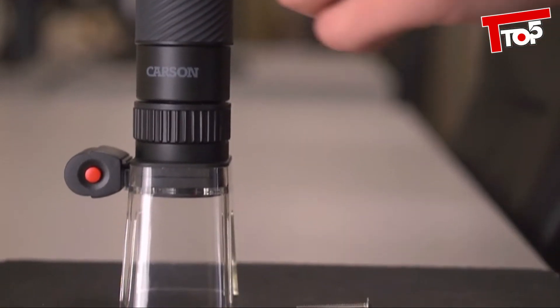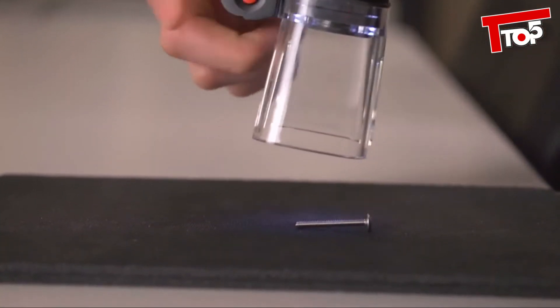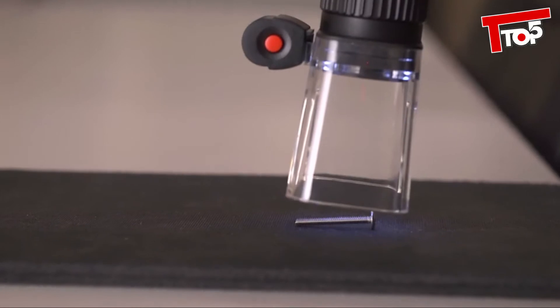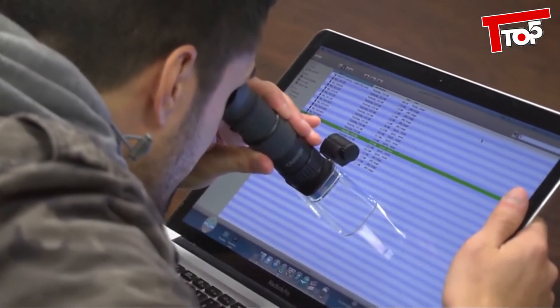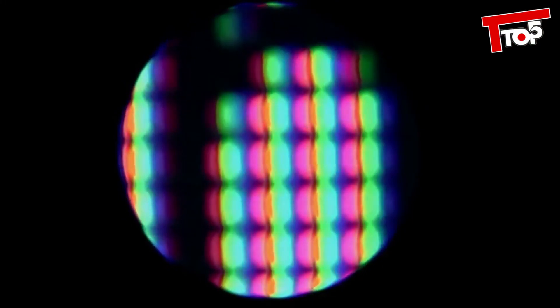When using the microscope feature on things like 3D objects, I was really impressed with how sharp of an image you can actually get. The fact that you can manually focus really lets you inspect 3D objects easily. Put the microscope over anything and you're guaranteed to get some interesting results.